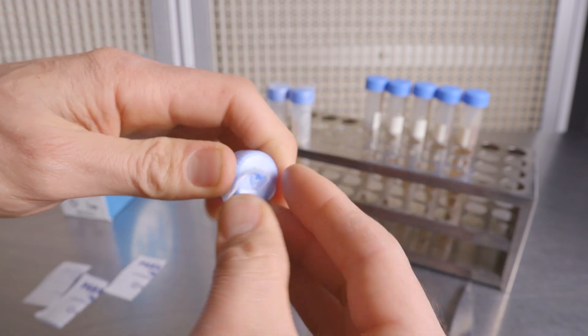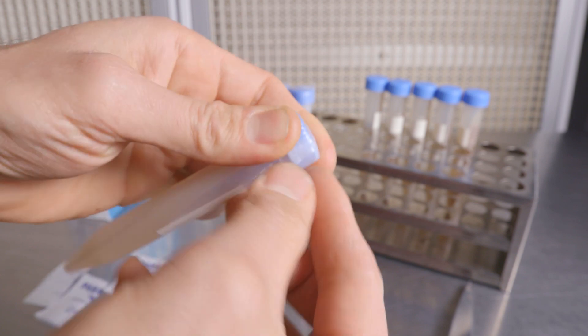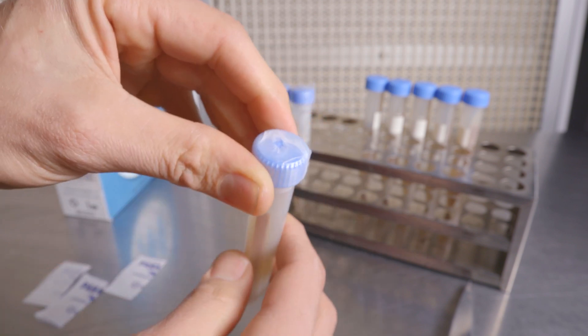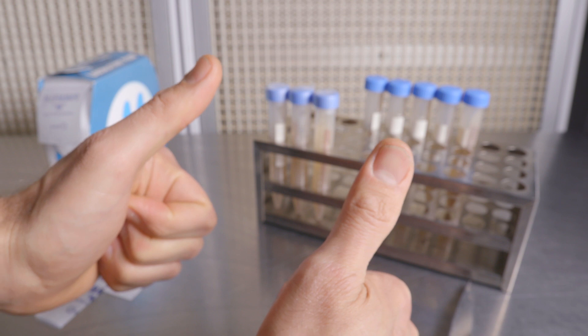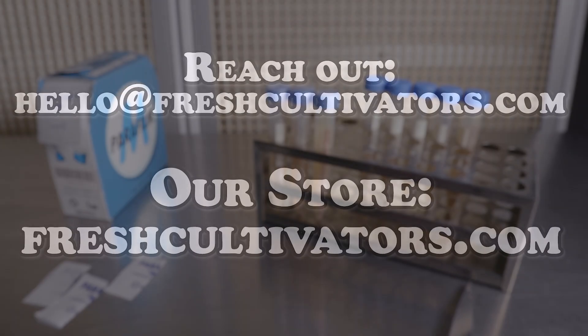Now just repeat this with all your other slants and place them in your fridge until you're ready to use them. Properly stored slants will last about a year which is around the time it's good to renew them. And that's it!